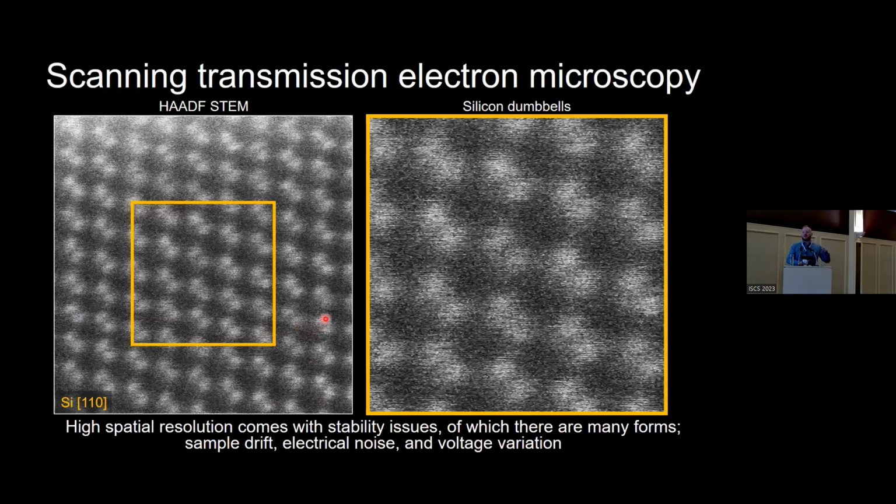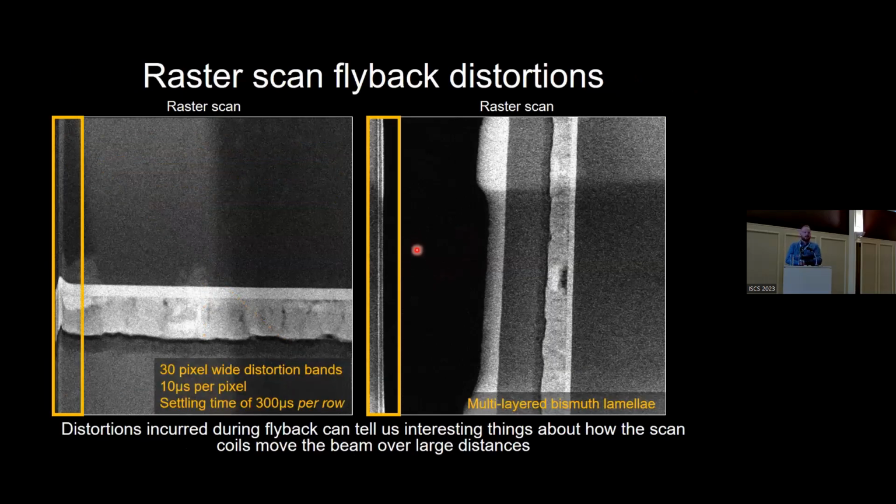The reason you get this here is that by the time the microscope started, you've got a nice continually formed image. Now, the problem is that you don't have any control over this. This is all proprietary. It is done by whoever is doing your scan control for your microscope. This could be the manufacturer or some other third party. Typically, people use third parties all the time. So you don't really have any control until you start turning things off, and that's when we're looking at this. We want the most control when we're scanning because we want to know what actually happens.